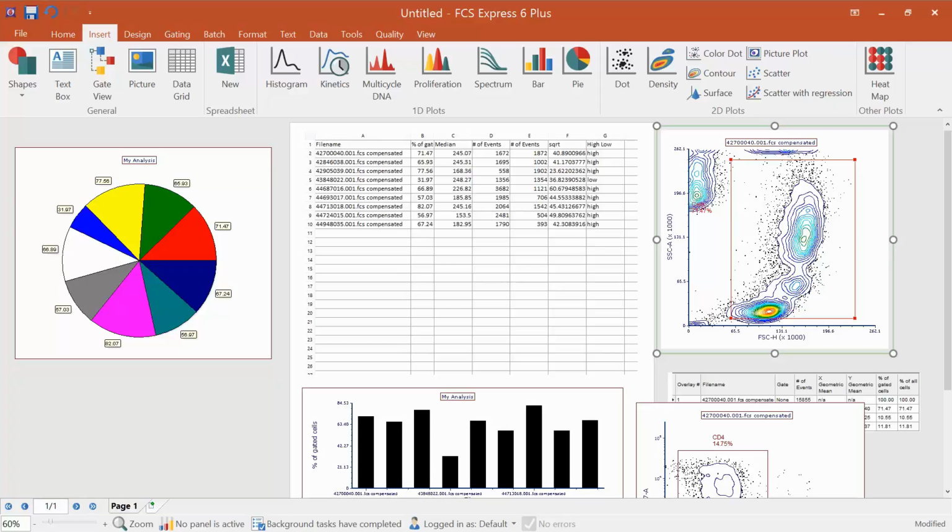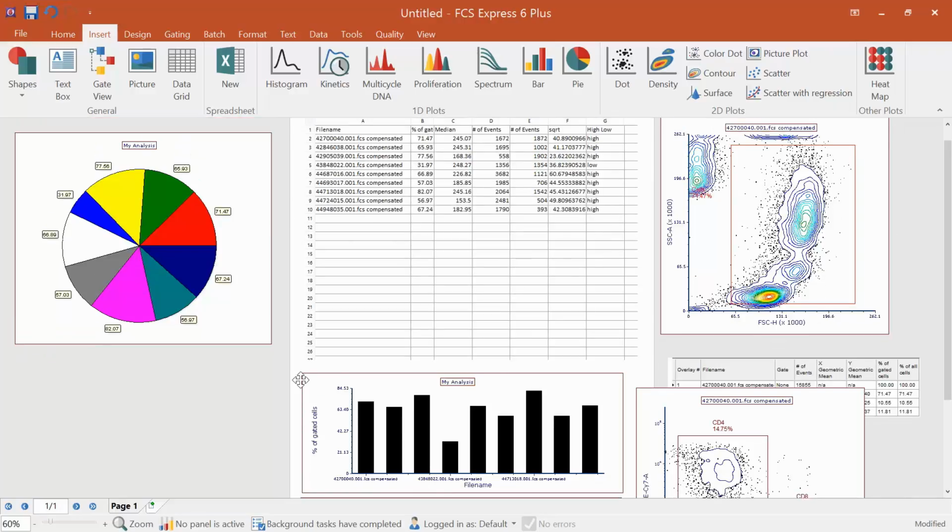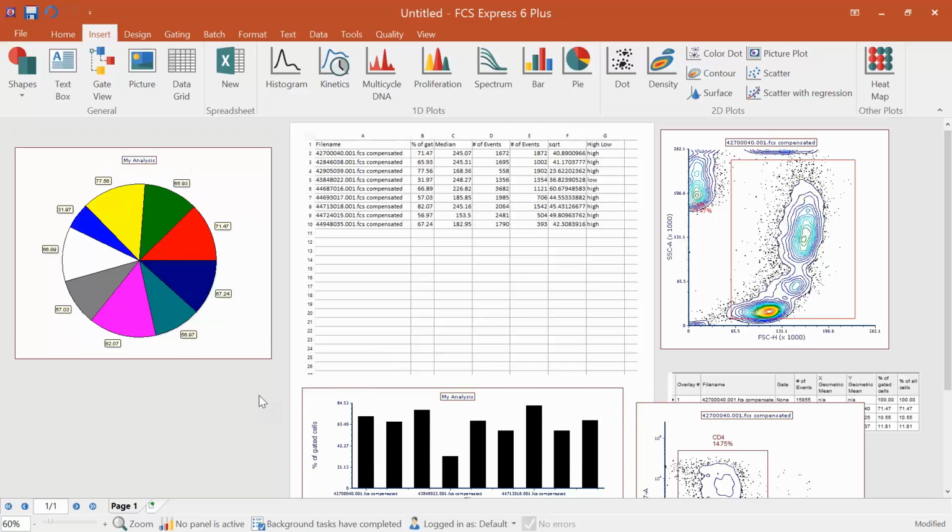If you need error bars, or you need to do t-tests, or any kind of that functionality, there are options in here to use those and create error bars based on different parameters, just like you would do in Excel. But we're going to be putting on entire webinars dedicated to graphing. It's its own feature in and of itself. We hope you'll join us for those webinars and see some of our resources for working with graphs. But we are going to focus on the data entry and using spreadsheets today.